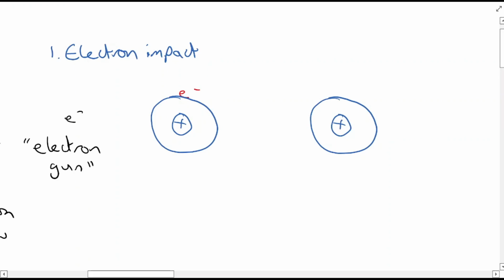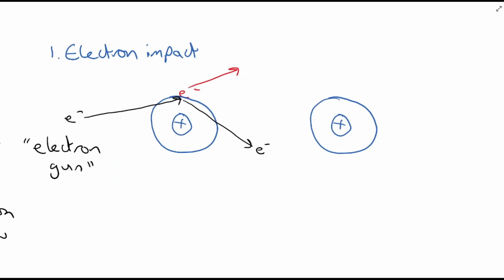So here's my electron, and those beams of electrons are going to be fired through the gaseous sample, and what they're going to do is strike the outer electron of an atom and ricochet off, a bit like the cue ball in snooker or pool ricocheting against the red maybe. As that happens, the electron will be jettisoned into space, okay? In this case, the space of the chamber, not outer space. And this creates an overall electron deficit, and that is our positive gaseous ion.